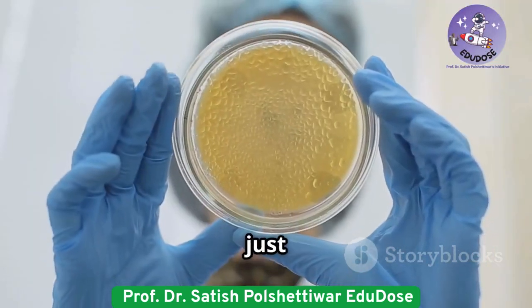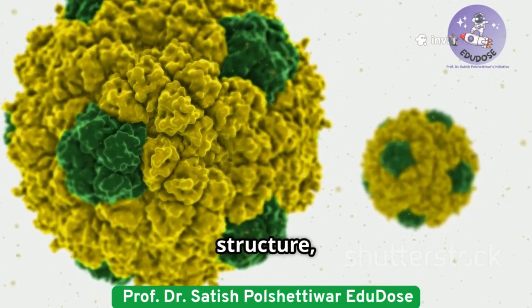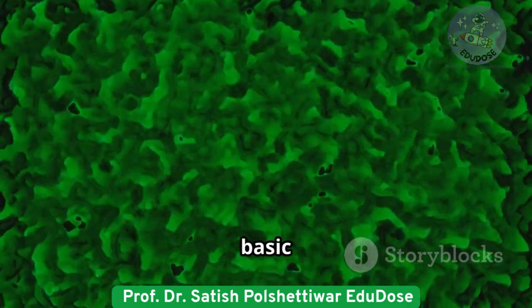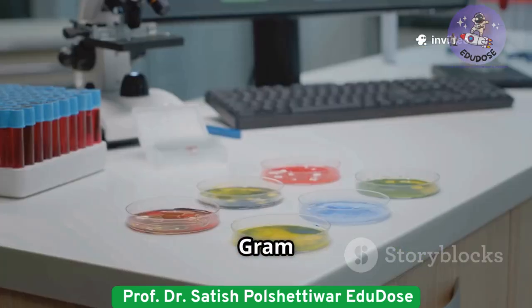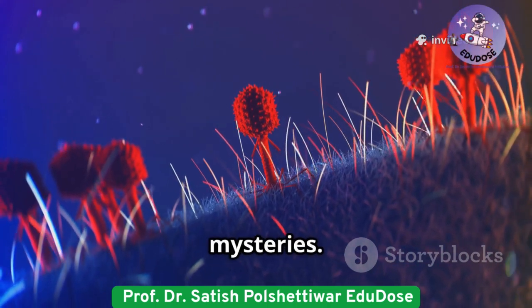So staining isn't just about making bacteria colorful. It's about unlocking their identity, understanding their structure, and revealing their secrets. Here's what to remember. Simple stain, one dye, basic info. Differential, compare and contrast. Gram stain, the gold standard in clinical labs. Special stains, a deeper dive into microbial mysteries.